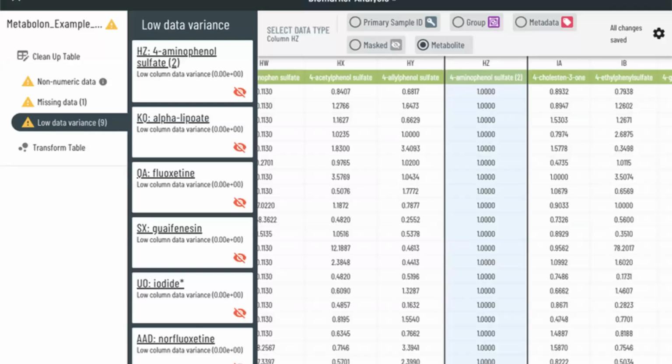So here's what it looks like. You have these errors. I'm sure, can you see? I want to put up a pointer. Okay, so you see that if your data is non-numeric, in a column that should have numeric data, it gives you that error. If you are missing a data, it tells you that there's a missing data. And if there's low variance in your group, it tells you that there's no variance. So you can't start the analysis unless you have addressed these errors.